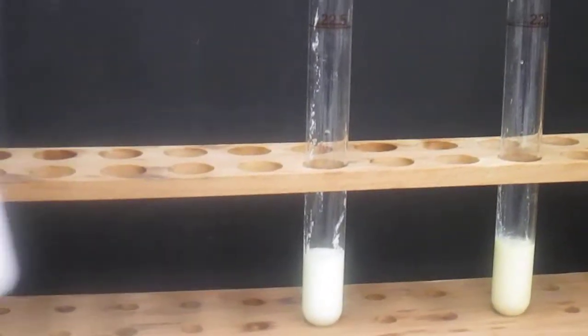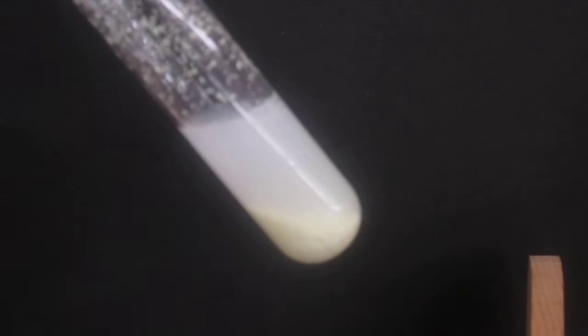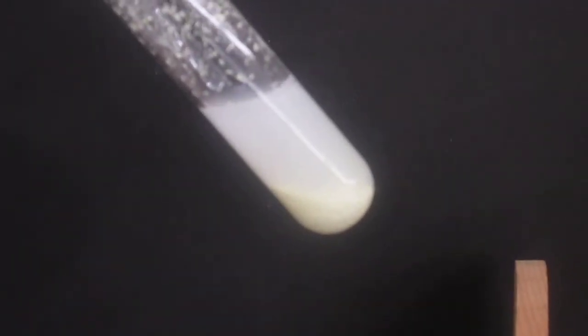Sodium chloride, as we mix it and shake it, you can see that it's fairly white and chunky. And when we shake it, it has a tendency to settle to the bottom. Our next one is the sodium bromide. This one's probably a little bit harder for you to see, but it is a very pale yellow, almost like a butter yellow. And you can maybe see the chunks that have settled to the bottom. There, you can see the layer that has developed.